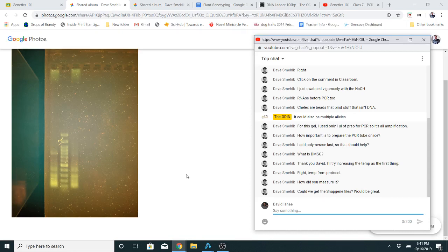One thing you can do is run PCR without a template at all. Just use some water, or fill it out to the same volume with blank water, and then run everything again. That will tell you if you've gotten anything in your primers, because one of the big problems if you make a pipetting mistake is you can touch your template with the pipette tip, pull up some template, put it in a reaction, and then go right into your primer tube with the same pipette tip.